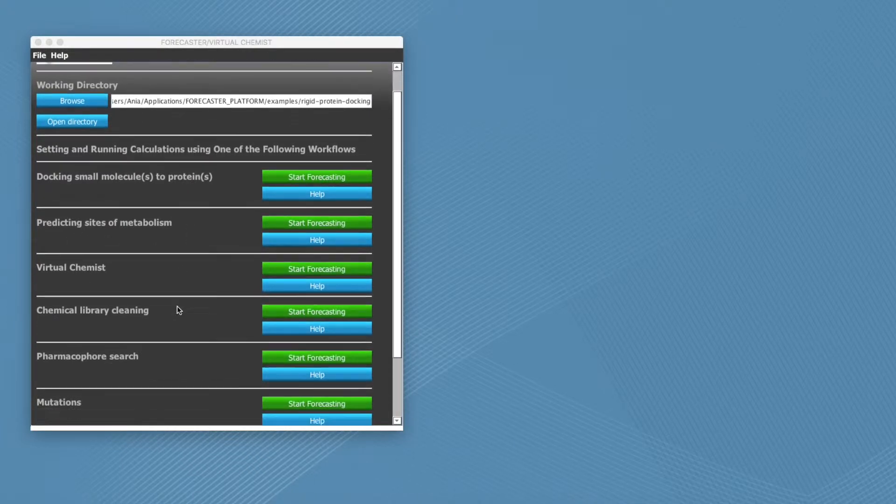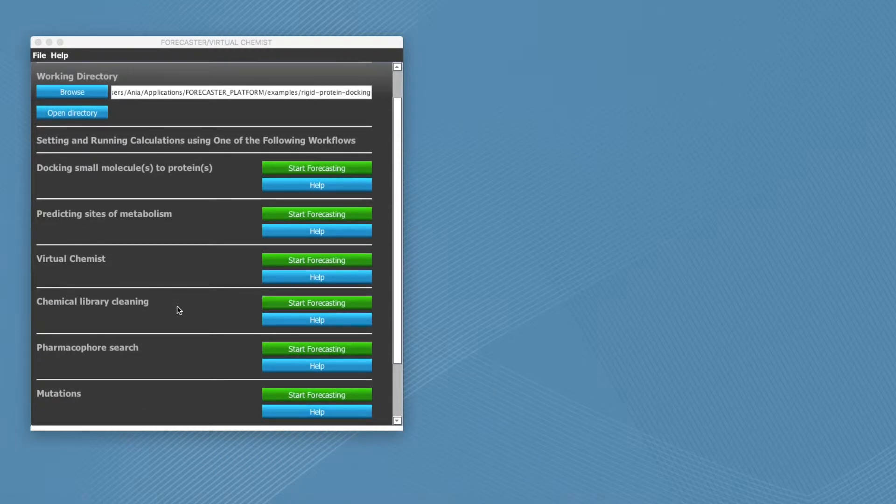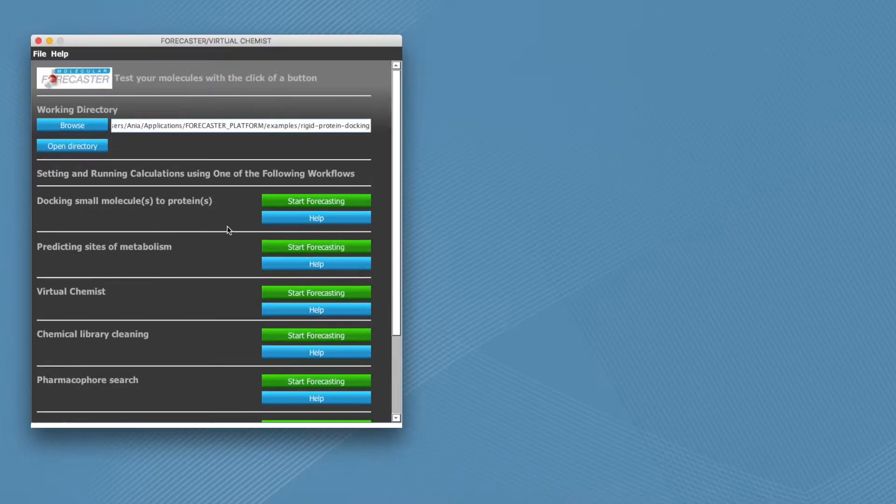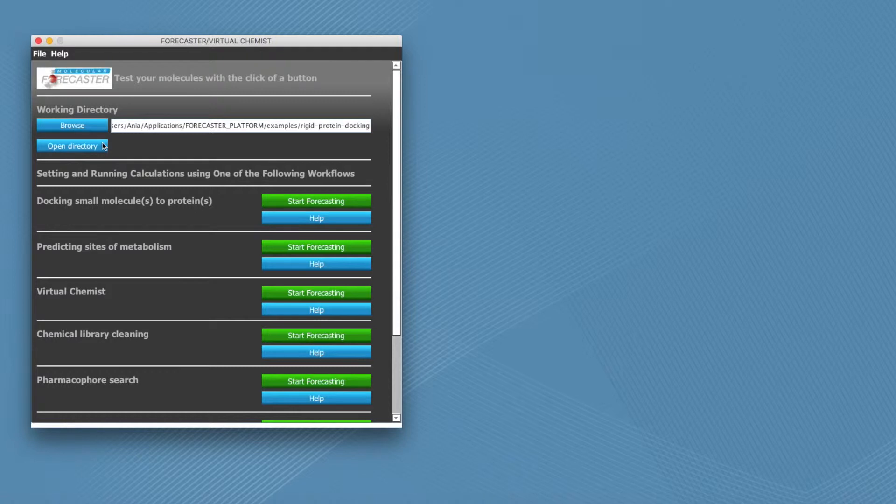You can also create custom virtual combinatorial libraries and study asymmetric catalysis in a fully automated way. To get started, select your working directory where your files are located and start forecasting with the appropriate workflow.